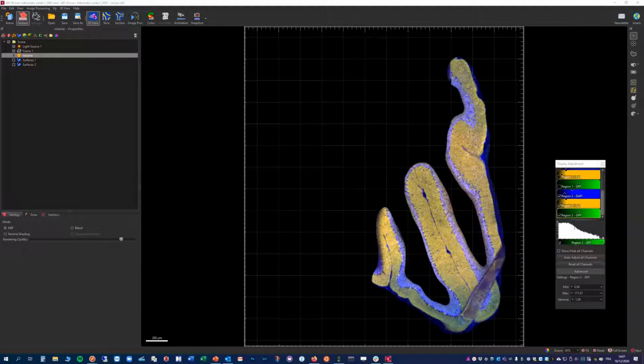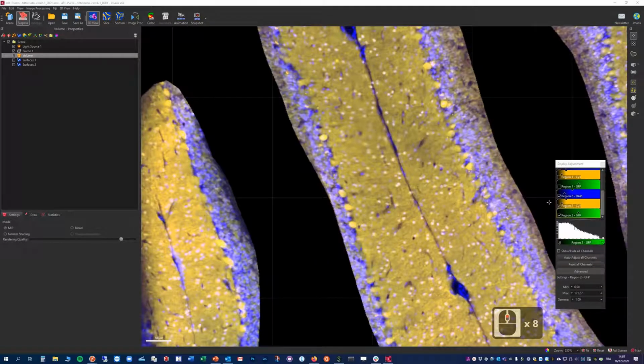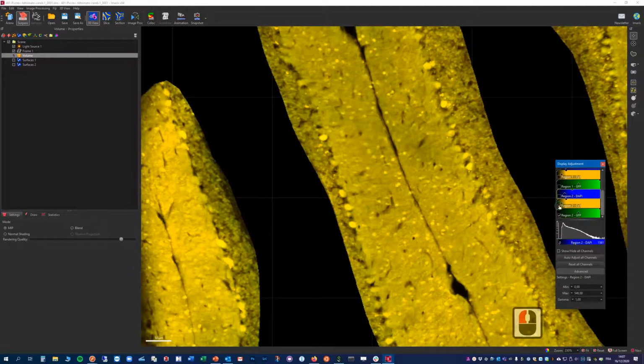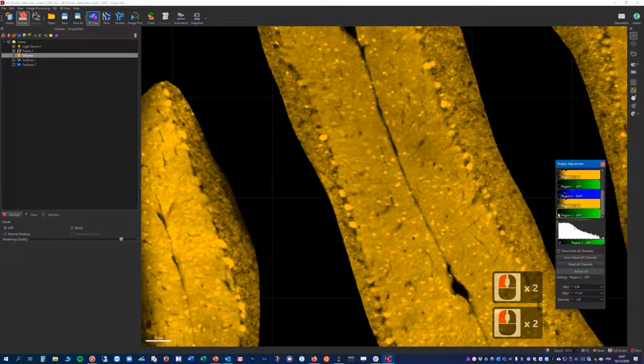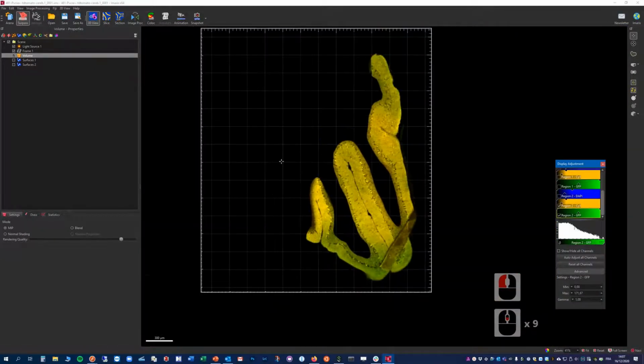Okay, so in this second video we will try to analyze the image, and we will want to count the small cells and the big cells here and classify them depending on whether they have high or low intensity in the green channel and in the yellow channel. So in order to do that, we have prepared the image.